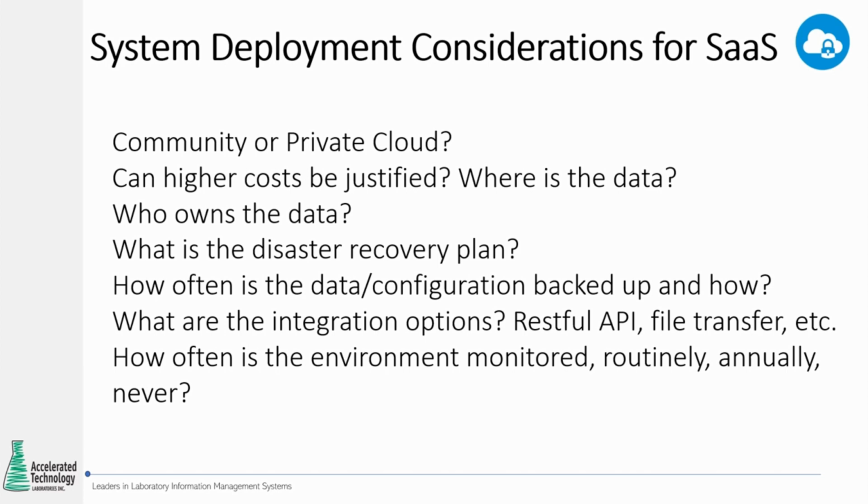Oftentimes, it's important to understand where that data is being hosted. Is it being hosted in Ireland, or is it being hosted in the U.S. or somewhere else? Who owns the data? There are some agreements that say that whoever's hosting the data owns it, so you have to be very careful and make sure that you always own your data.